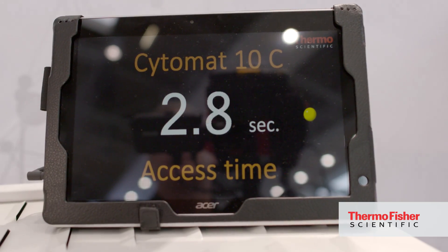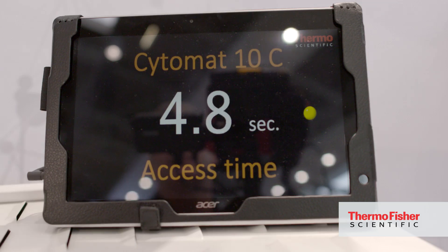One of the basic new features is the absolute speed. It has a plate retrieval time of less than 10 seconds, which is unique in the industry. It means that you have two to three times more interactions with the Cytomat than any other conventional incubator can have.